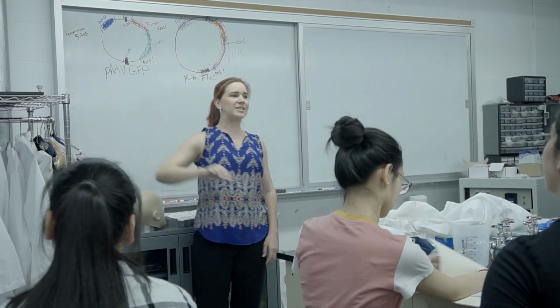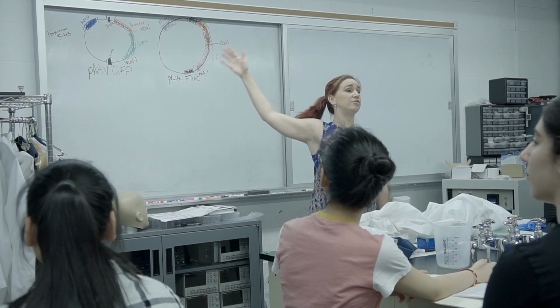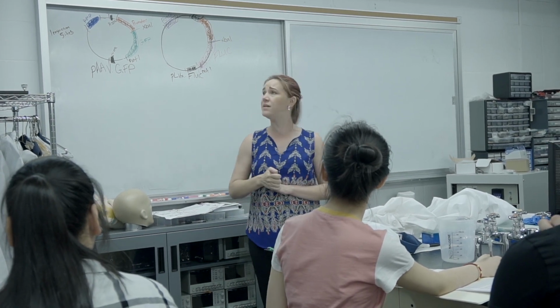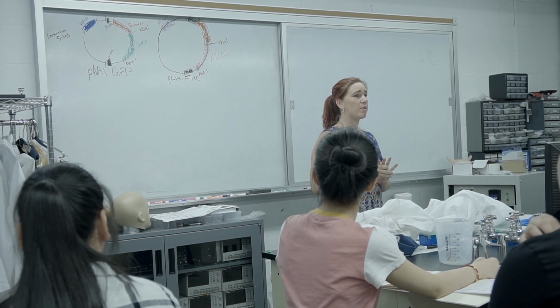The other important thing that we have in this, I made a whole bunch of brown lines, are the restriction sites when you design these plasmids. You might have 100 restriction sites in there. Some of those restriction sites will make 1 cut, some of them will make 5 cuts, it depends. And we used a restriction enzyme earlier. Does anyone remember what it was?